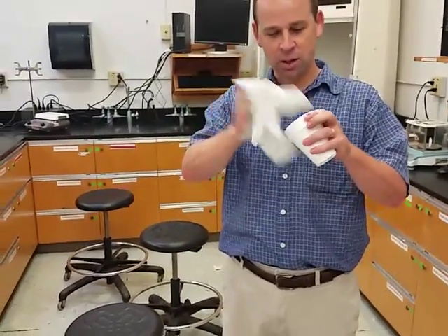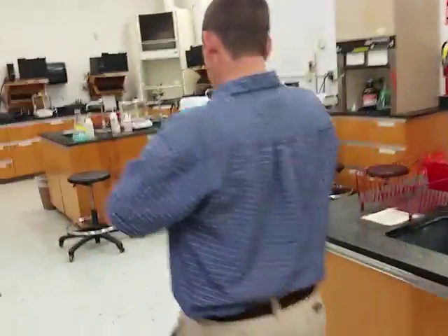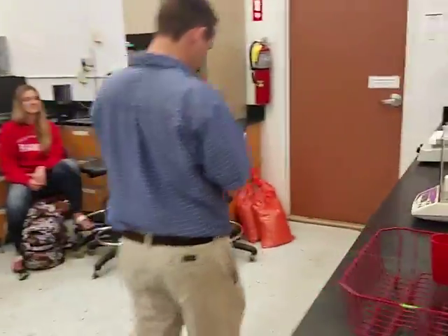Yeah. Okay, so I'm going to just dry this out and make sure that I don't have any residual water in there. All right.